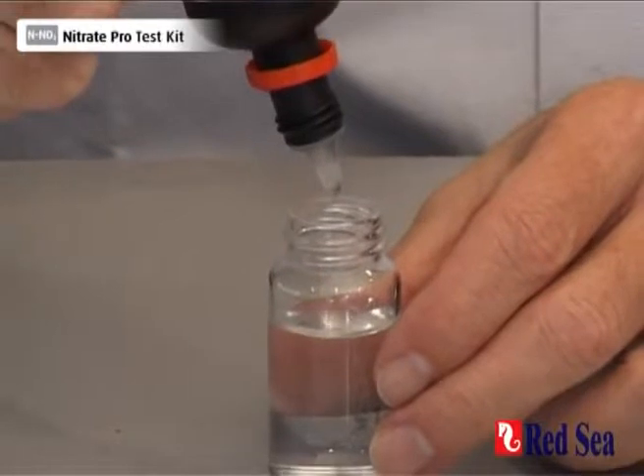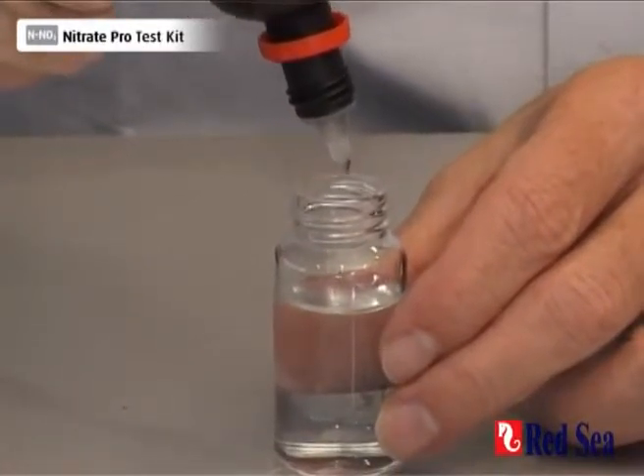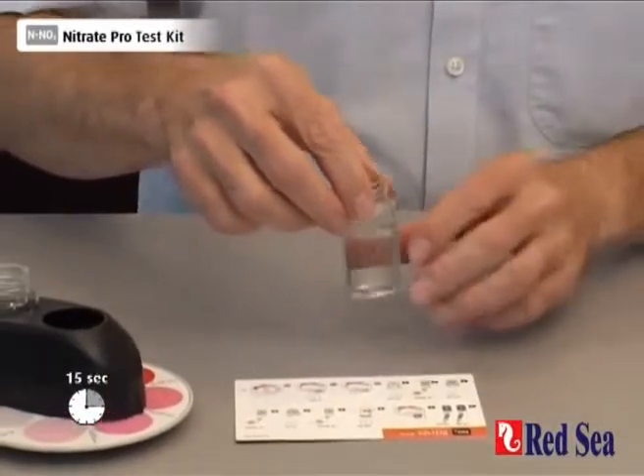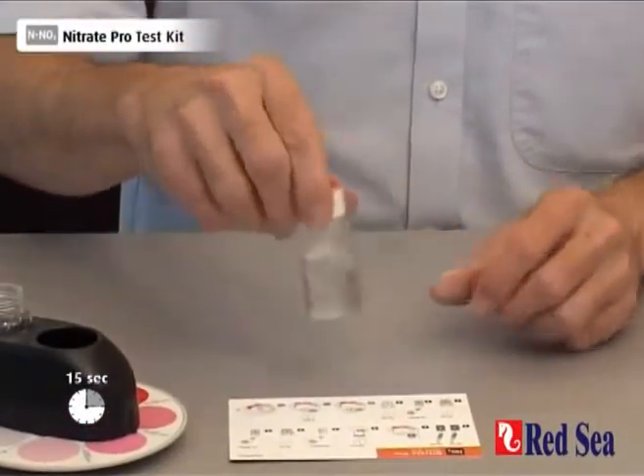So we do one, two, three, four, five, six, seven, eight drops. We then have to shake for 15 seconds. It's best to use the lid before we do that.